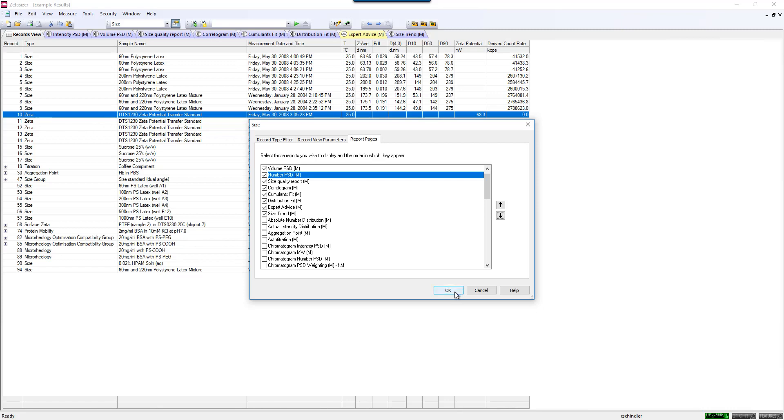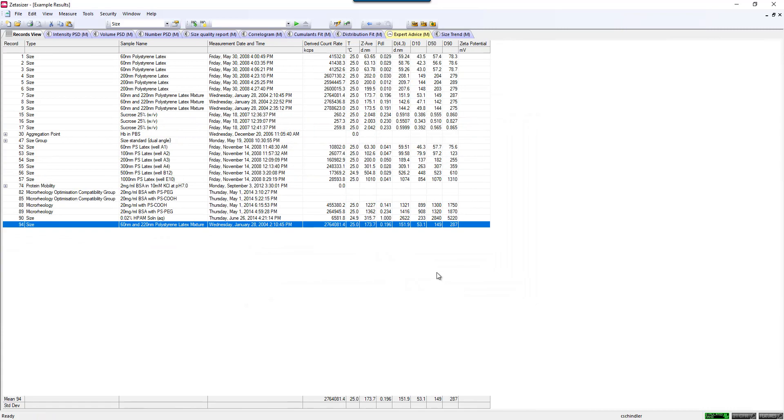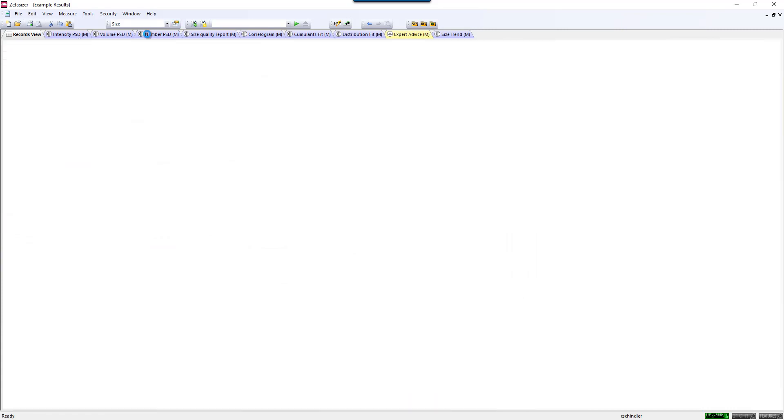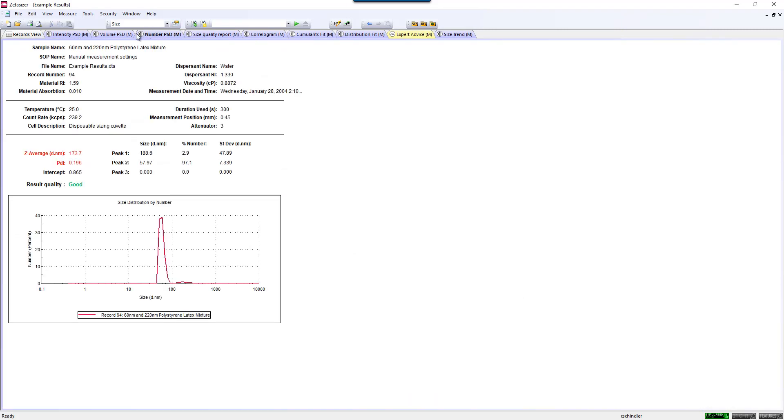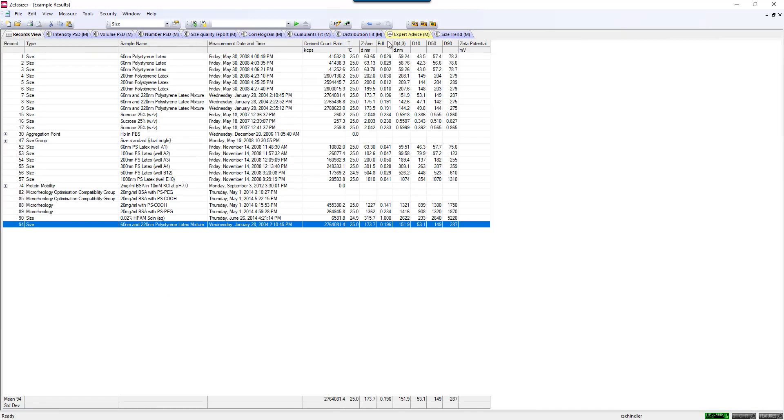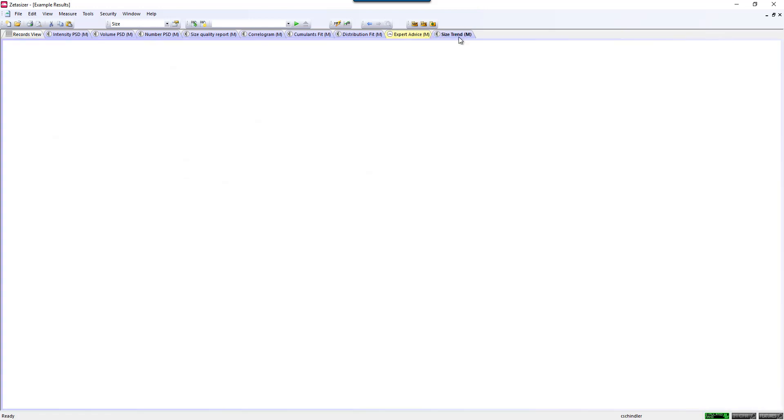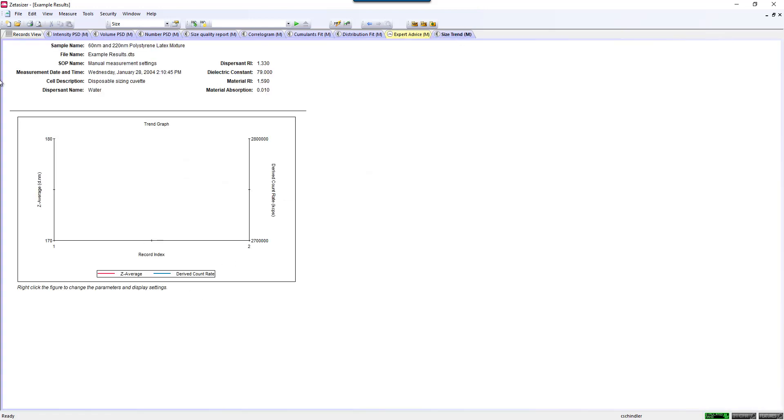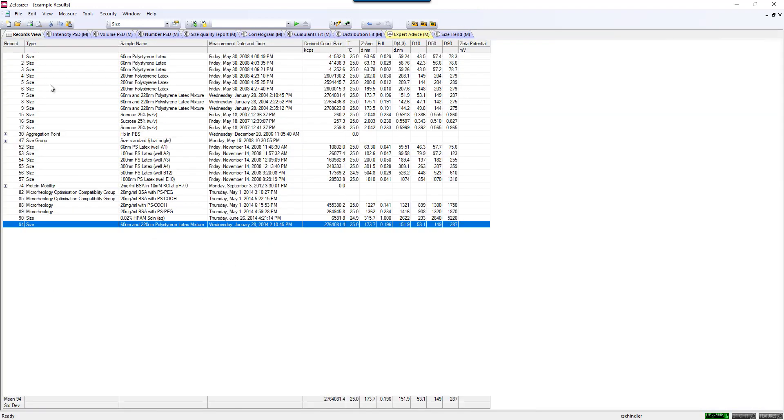Once you're happy with all this, just click OK, and then you'll see those changes populate. Now we see we have our number distribution added, and also we have our size trend on there as well.